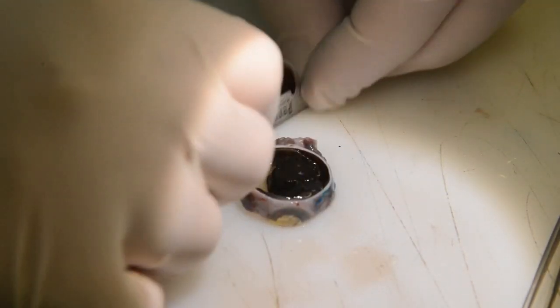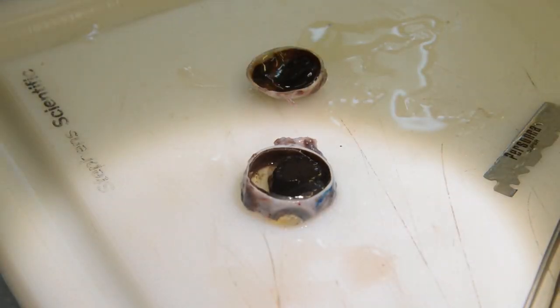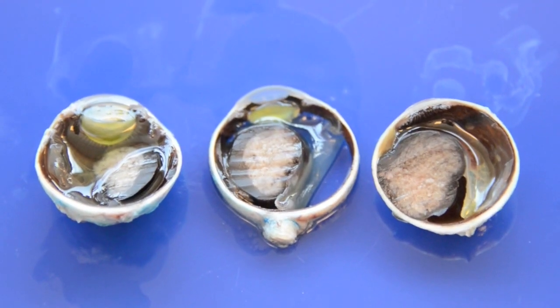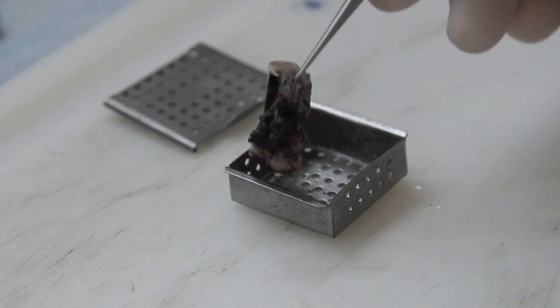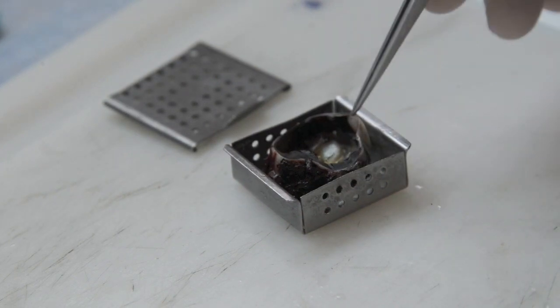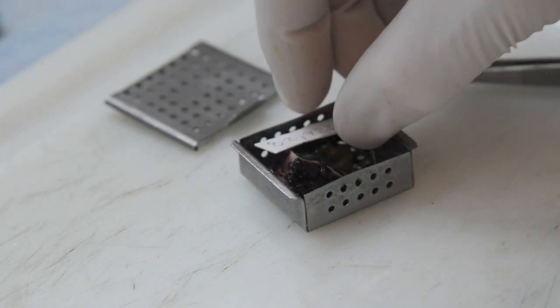The second calotte is then removed. The sectioned globe includes the central PO, or pupil optic nerve segment, and the two caps, or calottes. The PO segment and a slip of cardboard with the specimen's accession number are submitted for tissue processing in a metal cassette.